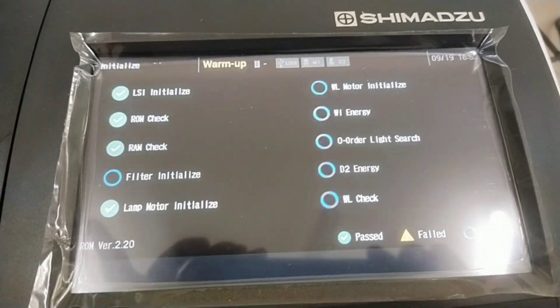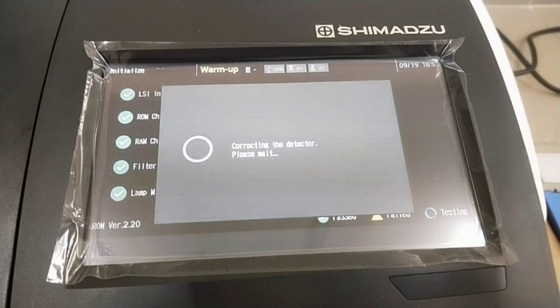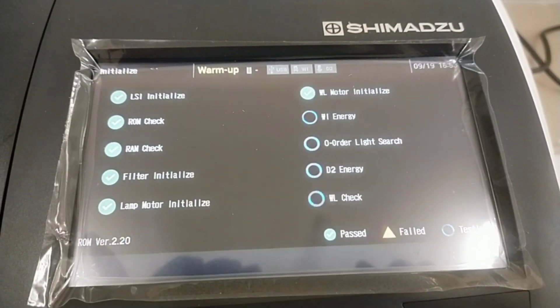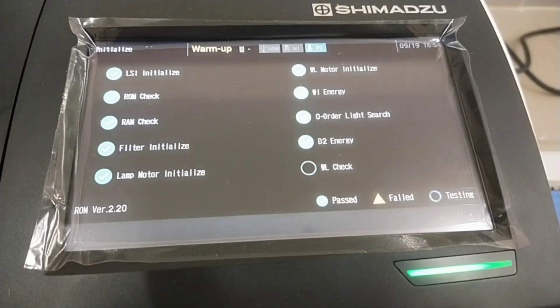After power on, do not open the sample compartment cover until the instrument initialization is completed. When the initialization of each item is successfully completed, the mode menu appears. Observe the initialization process.